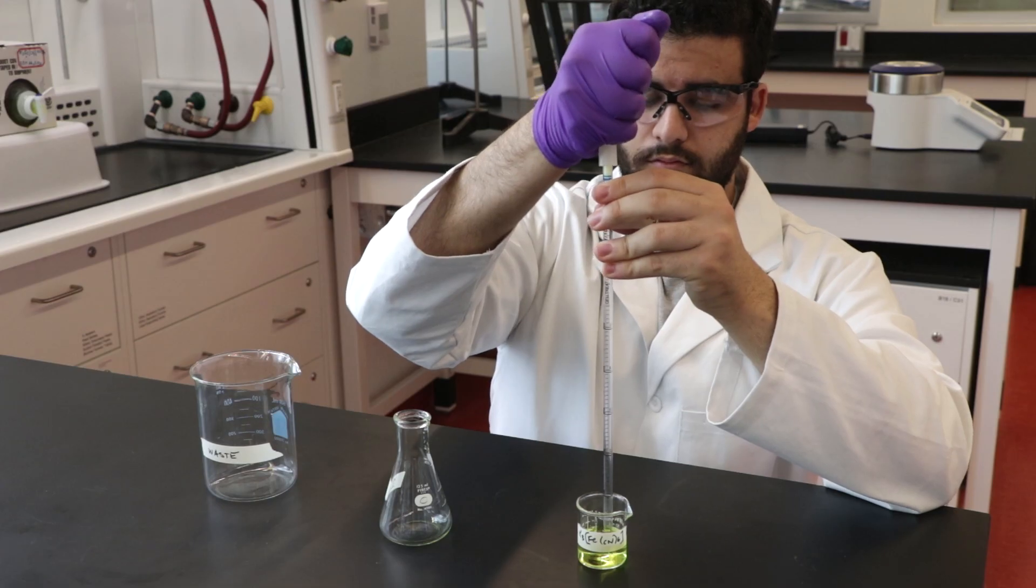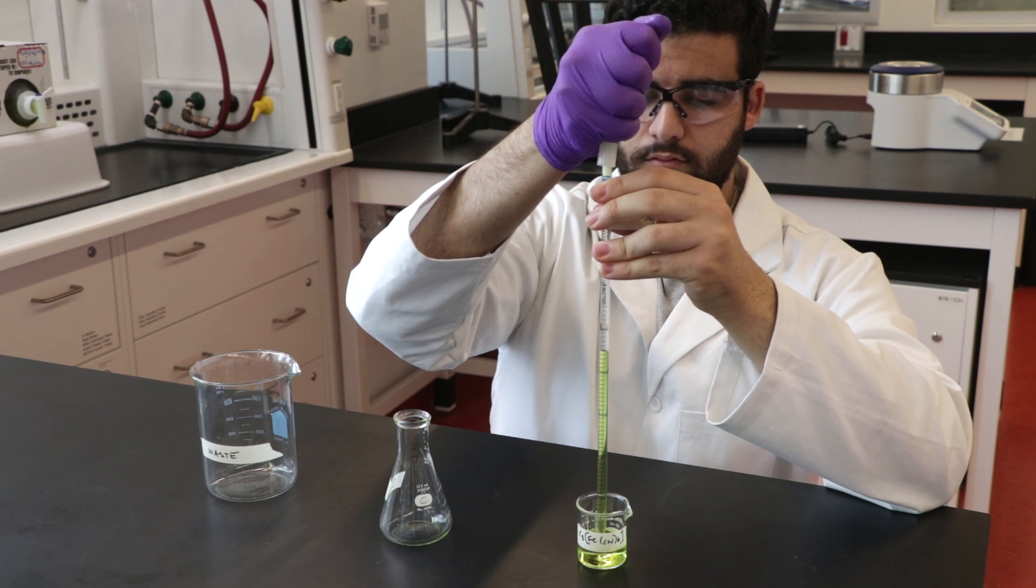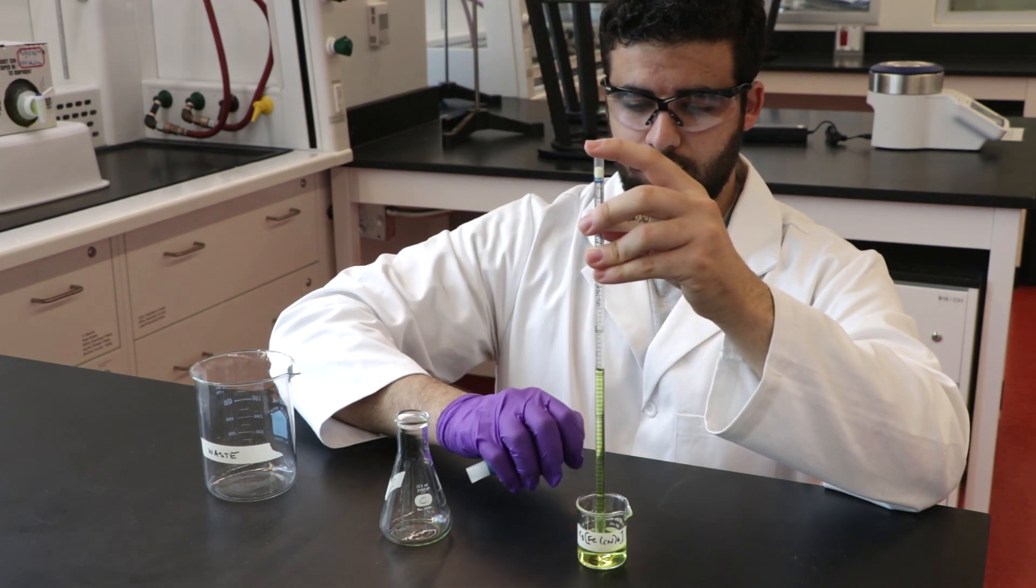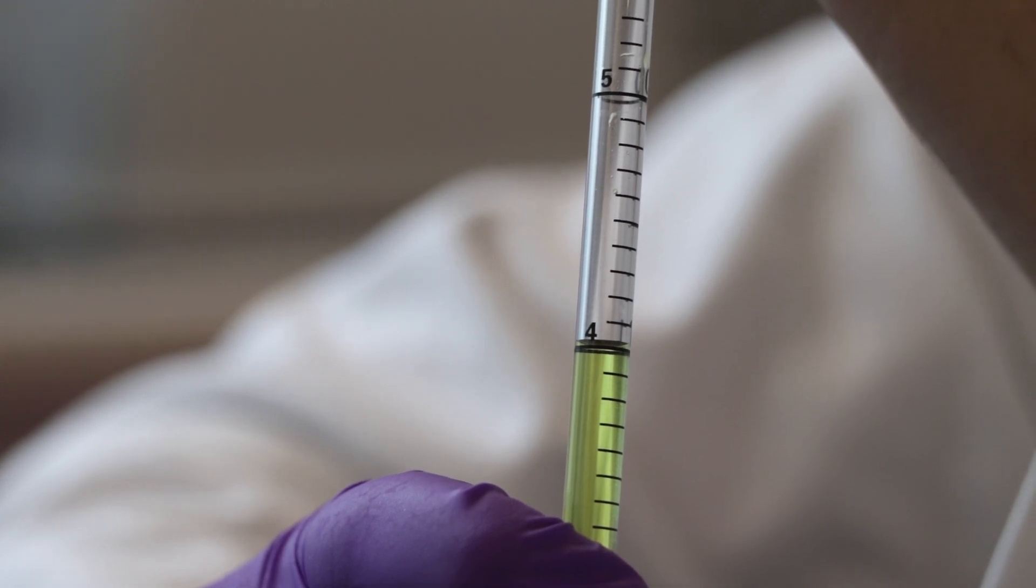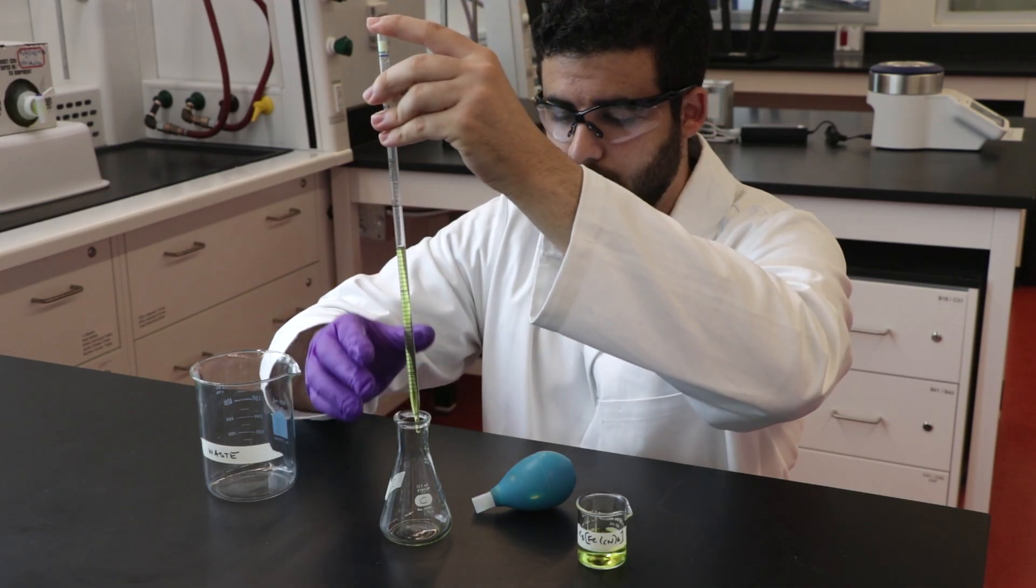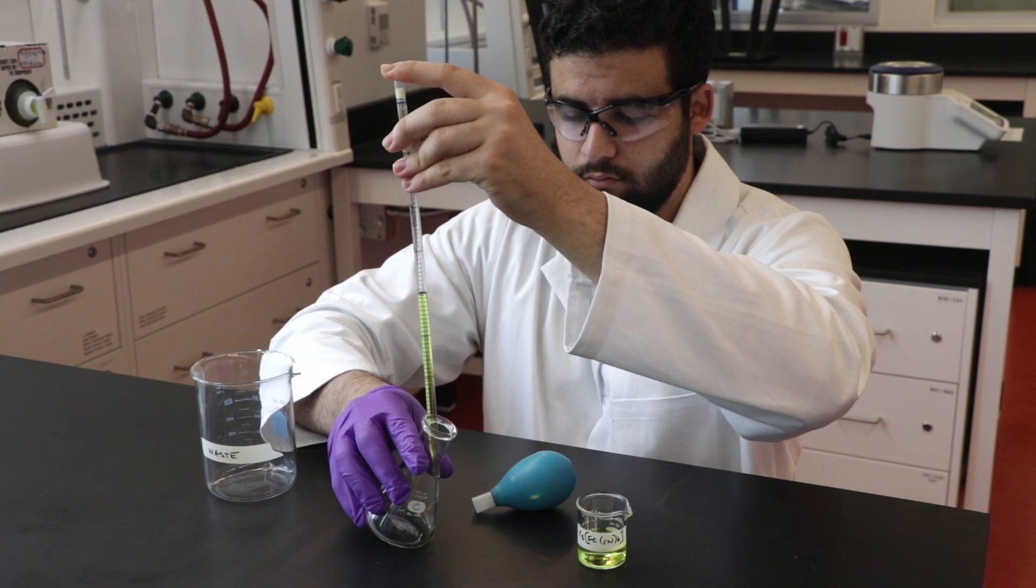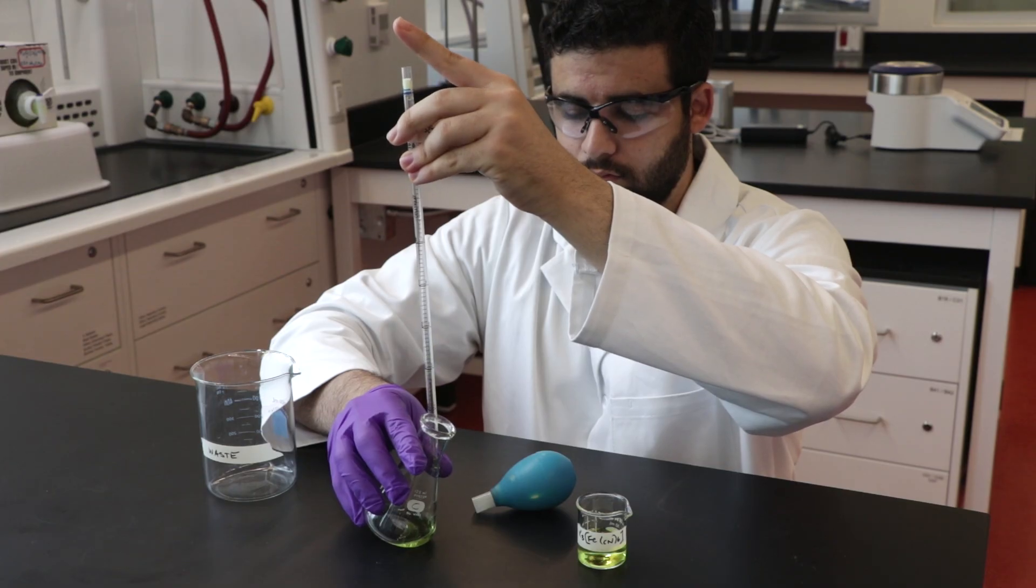Begin by pipetting 4 mL of ferricyanide into each of the Erlenmeyer flasks using a mohr pipette. Keep the pipette at eye level and ensure that the bottom of the meniscus is at the value you need to pipette. Remember to have one hand ungloved for this step.